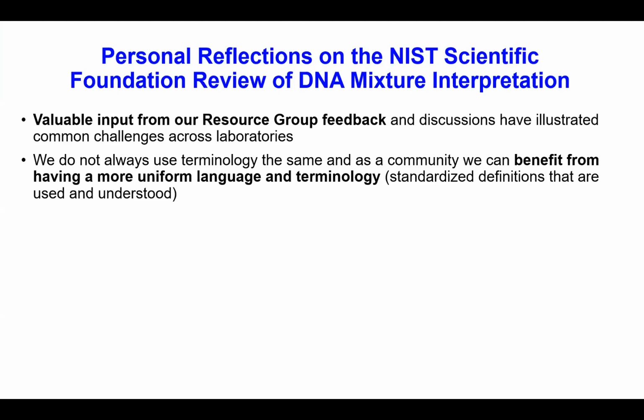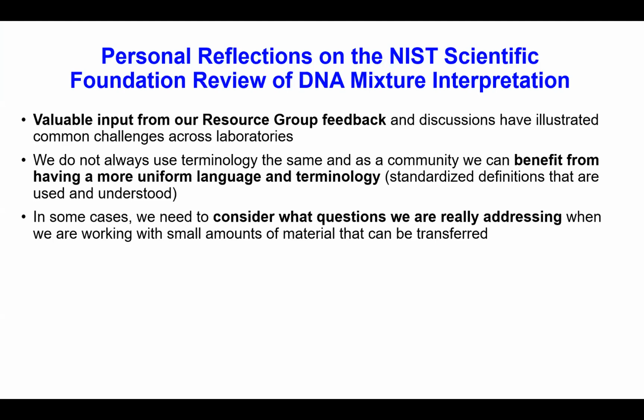One of the big realizations we've had as we've been exploring these topics is that we don't have common terminology for what even is a trace DNA or touch DNA, or how people approach setting thresholds, such as analytical thresholds, and so on. In many cases, we have to consider what questions we're really addressing. Just getting a result and a likelihood ratio number, what does that really mean? So we put a lot of thought into the issue of relevance and the aspects of small amounts of material possibly being transferred.